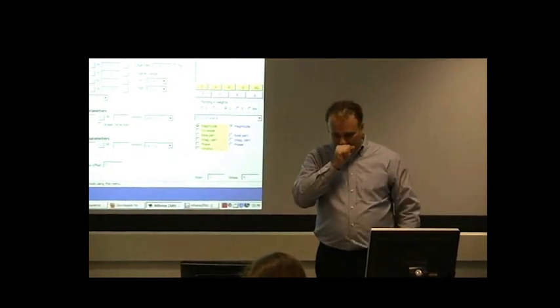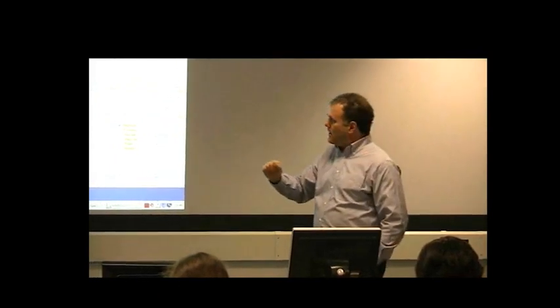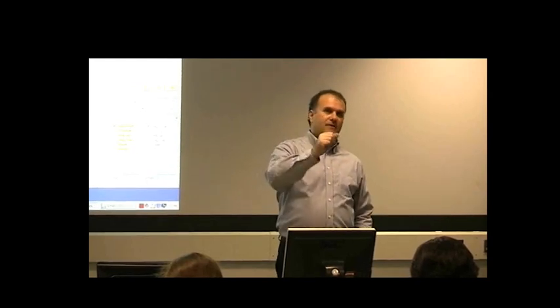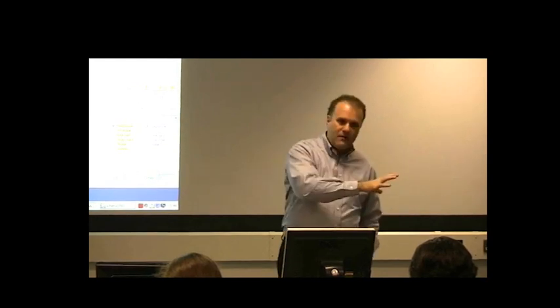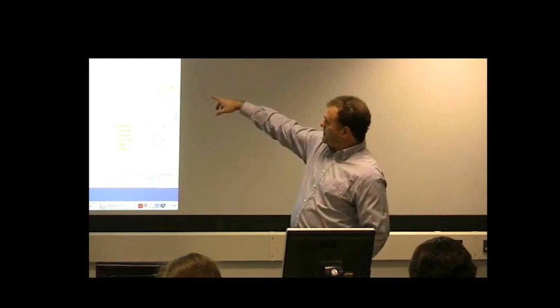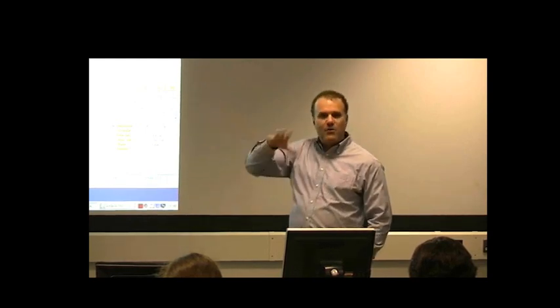You will see tomorrow when I start talking about Artemis that the Kweight that we use when fitting the data, you make that decision on the basis of a completely different set of criteria. And that, for me, is independent of that Kweight and independent of how you display the data. So Kweight is situational in the different parts of the workflow through your data.